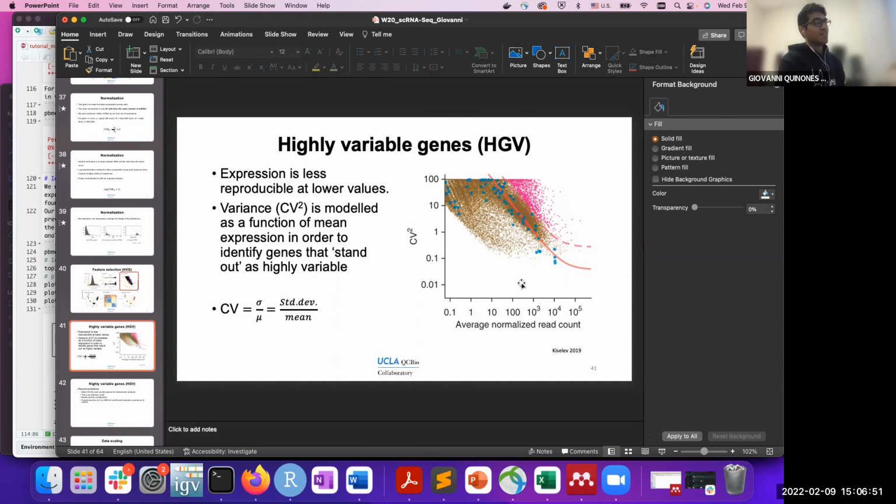Okay, so a spike-in, we mentioned it yesterday, is actually an RNA molecule or a set of RNAs that you introduce into your experiment. So the purpose is that they serve as controls because you already know how many molecules you're inserting. And when you complete your analysis, the sequencing and quantification and all of that, you can check the value compared to what you were expecting.